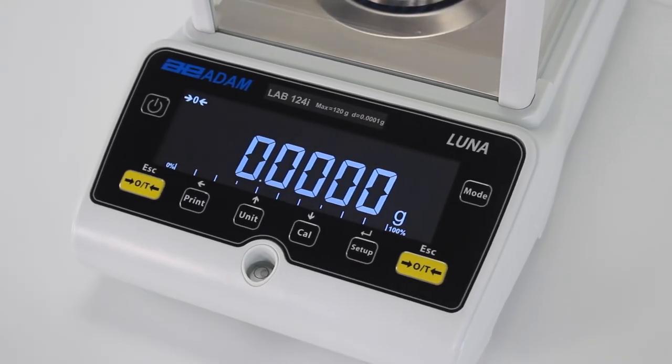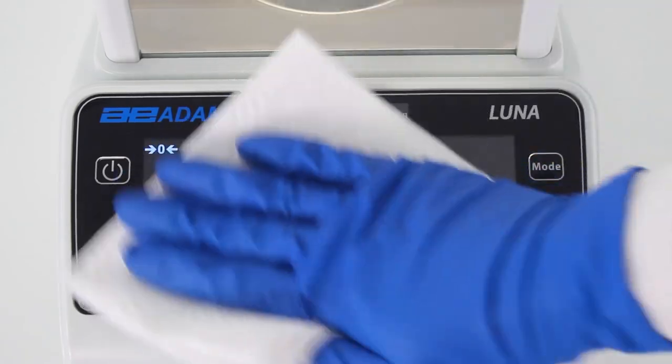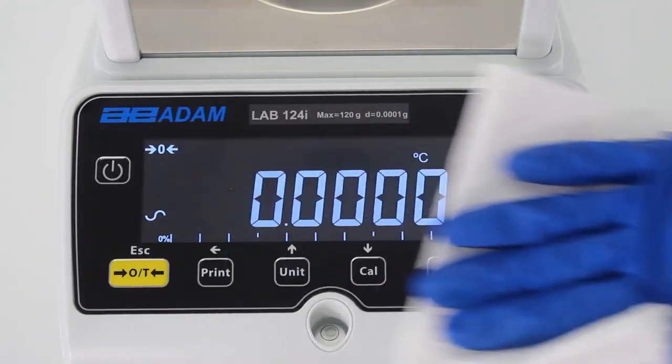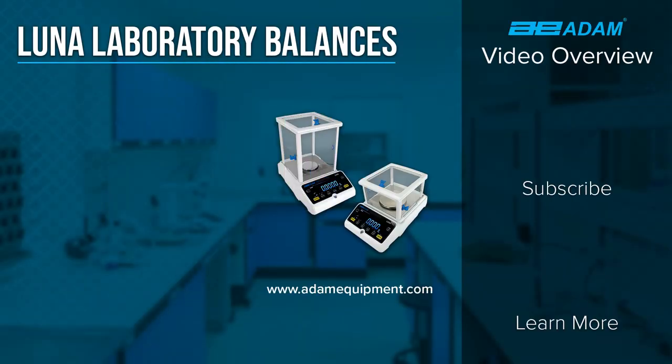Robust ABS plastic construction and a stainless steel pan help make LUNA both easy to clean and durable enough to withstand demanding lab use. To achieve stellar weighing results with LUNA, visit AdamEquipment.com or contact your local Adam dealer.